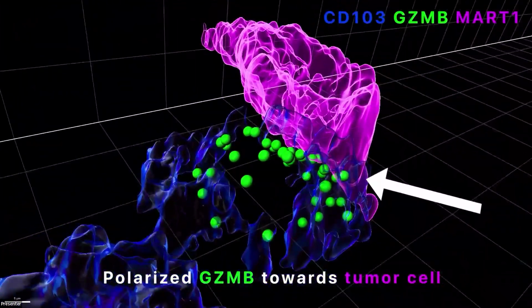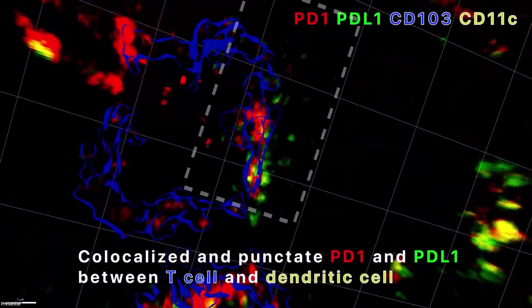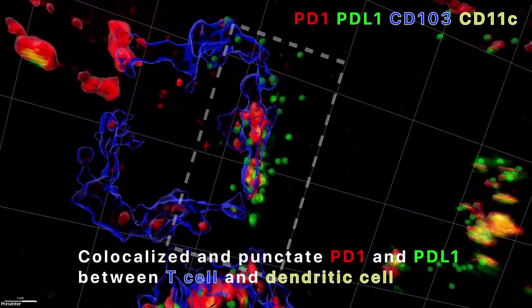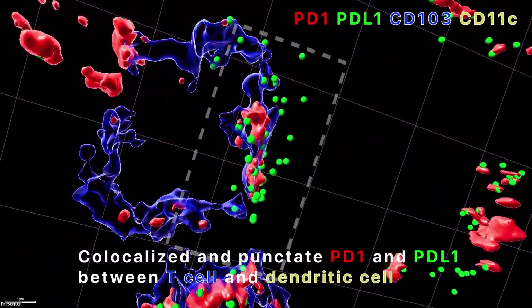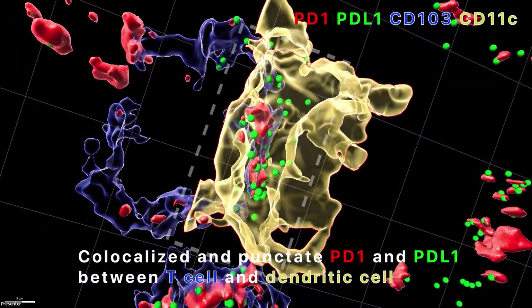Because we have 3D imaging, we can see that this T cell is simultaneously in contact with a CD11C positive antigen presenting cell, but counterintuitively is being negatively regulated via PD-L1, shown with green dots. Since this pattern is not well understood or characterized yet, it would be fascinating to understand what is happening here and how that impacts tumor resolution.